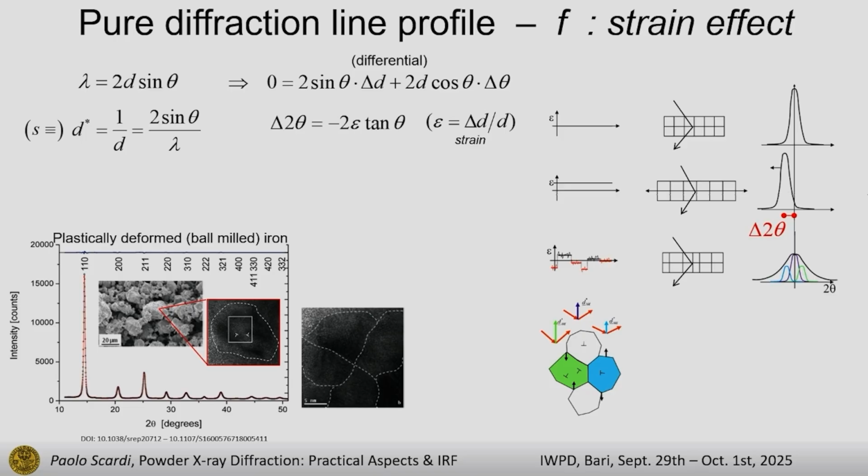And then the peak broadens, because it's a little bit like having many diffraction peaks, sort of. So the peak becomes broader. So the same tangent law is valid, because now it is not for the shift of the peak, but for the width of the peak. And in fact, we can write the same equation for the so-called half width at half maximum, which is half of the diffraction peak width, which is related to this E0 strain. I will tell you why I changed symbol, because things are more complicated than I'm trying to explain. It's a bit heuristic derivation, let's say.